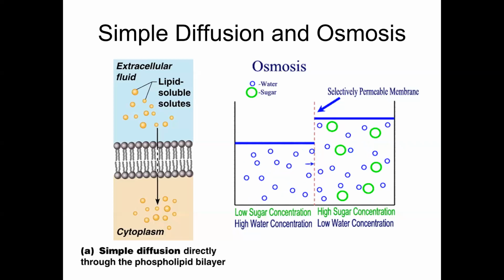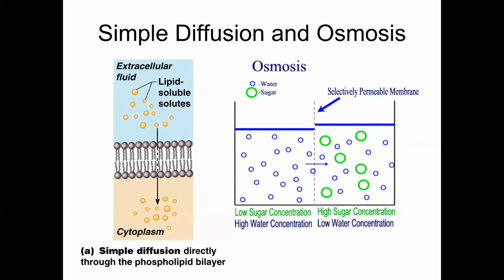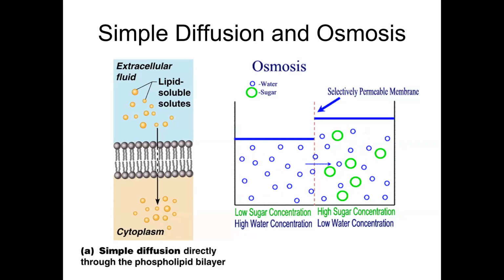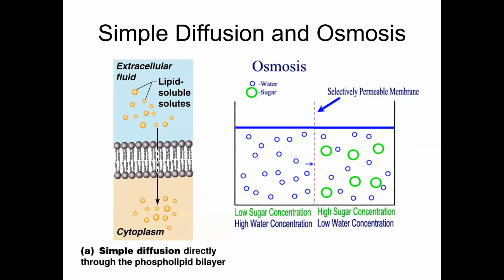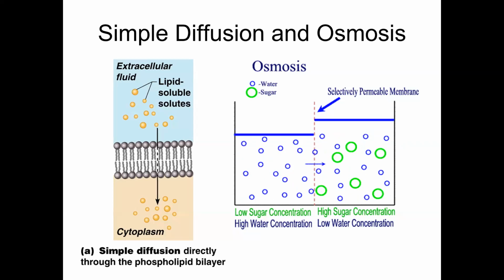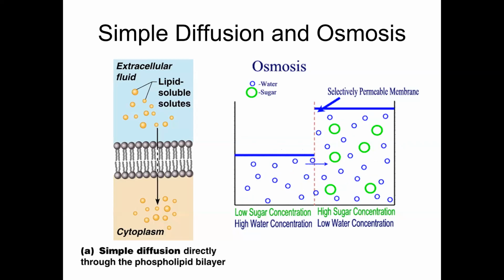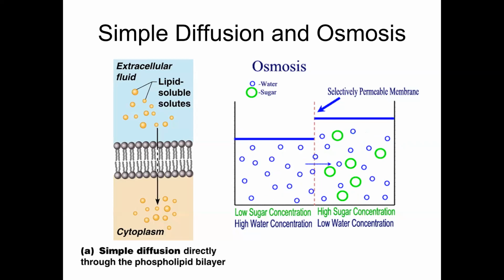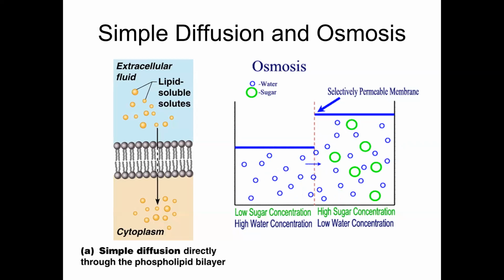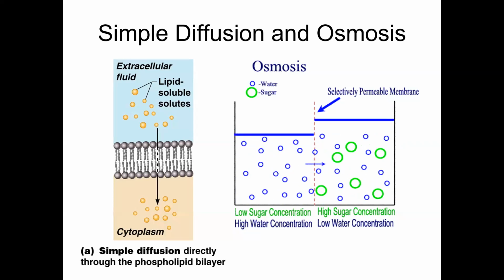Now, these are from yesterday, but these were filled. One was filled with distilled water and one, this artificial cell, was filled with salt water. It doesn't leak out because the holes are very tiny. They're microscopic holes. We use them for filtering in dialysis equipment. We have these tubes here. Here they are.